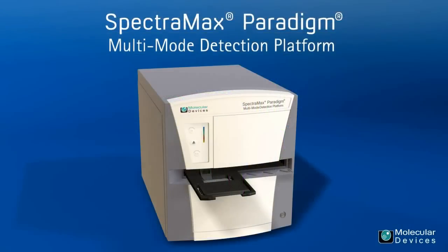The SpectraMax Paradigm system, from Molecular Devices, is the answer to your microplate detection needs.